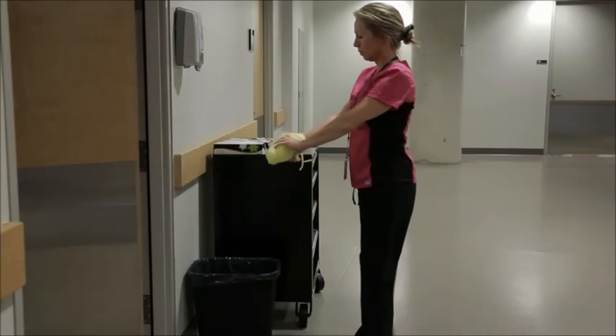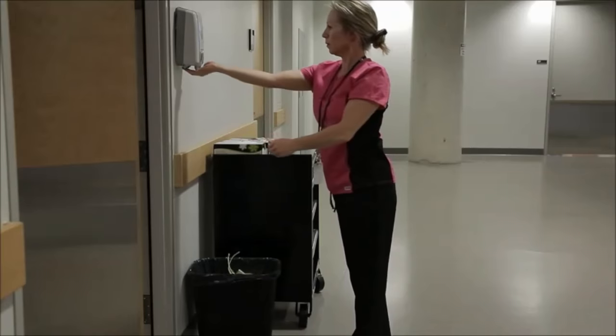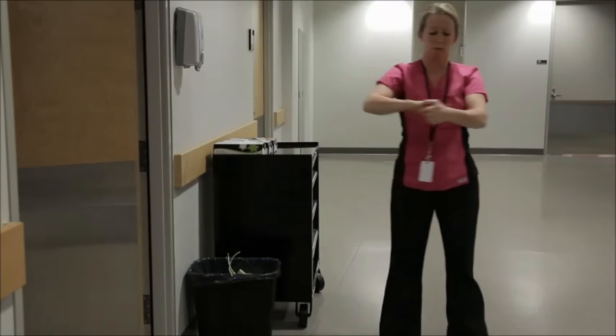Discard the gown into a linen bag or, if disposable, into a garbage container. Clean your hands for 15 seconds.